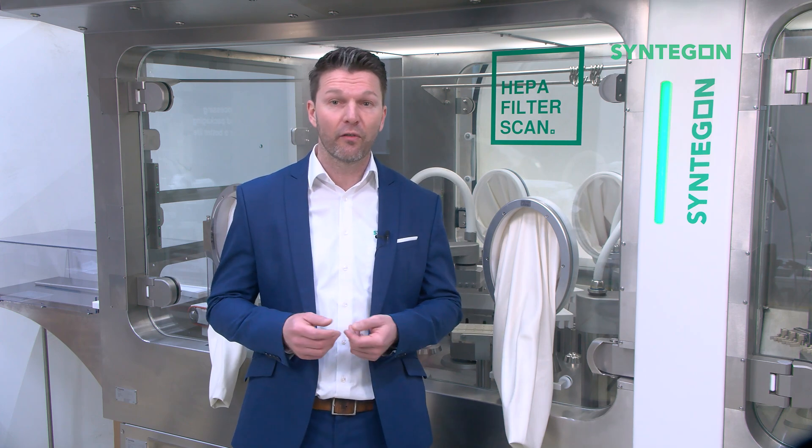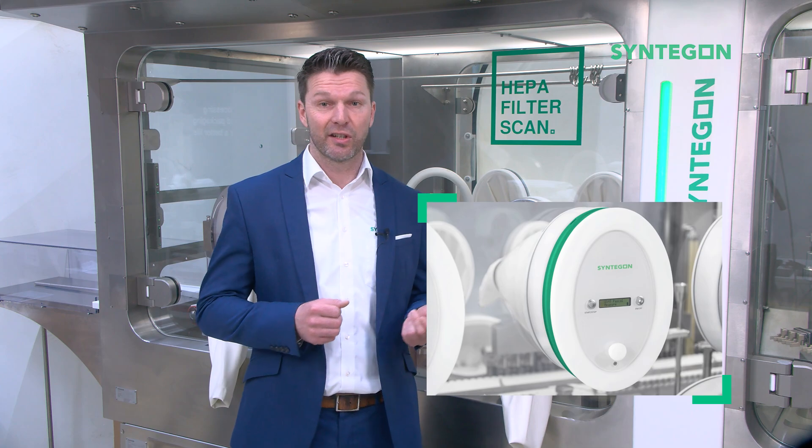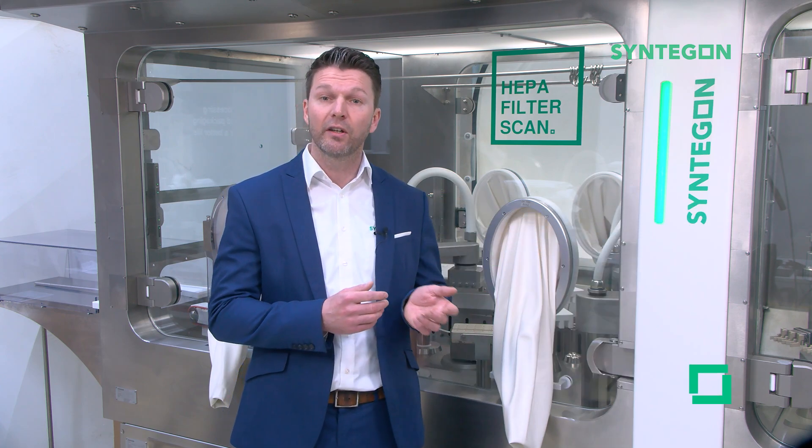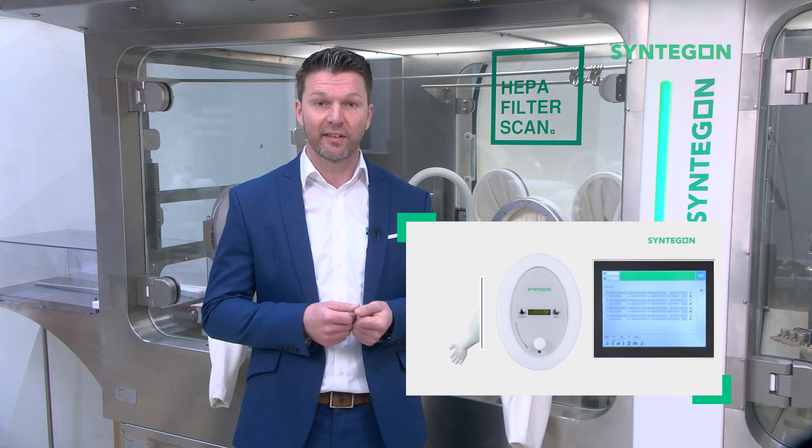You have different options of how to use the Glove Integrity Testers: either as a single test lid where you get the results shown on the integrated display, or as an integrated version for Syntegon Barrier Systems.